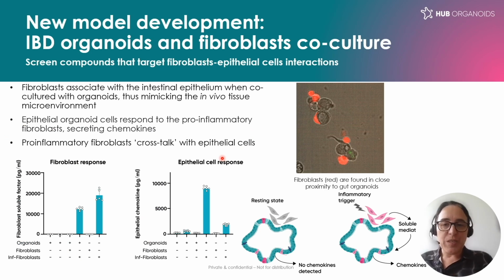One of the first experiments we did was to do the co-culture of the organoids and the fibroblasts in a 3D context, not monolayer, 3D. And we can see very clearly that there is a tendency of the fibroblasts to immediately interact with the organoids, have cell-cell contact, and actually impact the level of aggregation of these organoids.